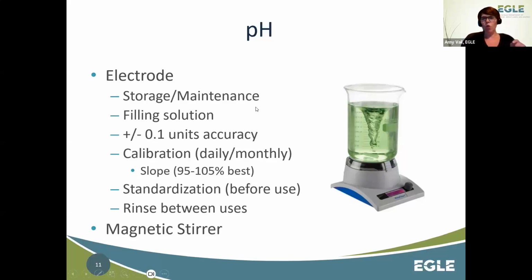If you have a hole that you're using for filling, a hole in the probe at the top, don't cover that up. A lot of people will cover that up because they think it's not supposed to be there. Sometimes they're shipped with rubber around that hole, but the hole is actually there for a purpose. Not only is it for filling, but it's also for exchange of air so that you can get proper exchange of things when you're using the probe. So it's supposed to be open.